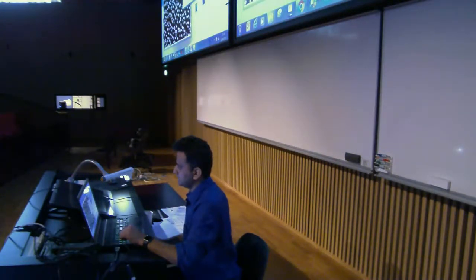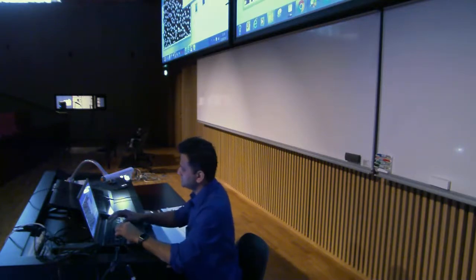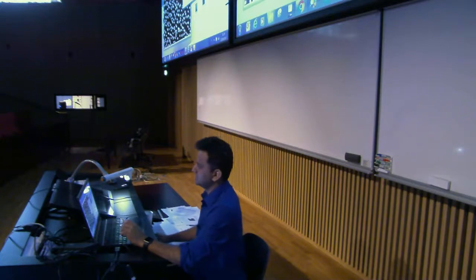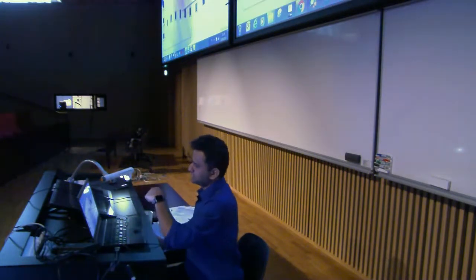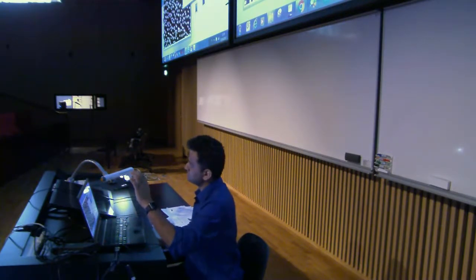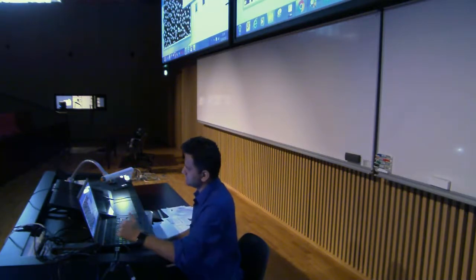And circularity, maybe I'm interested in knowing the morphology or the shape, I want to filter based on the shape of the nuclei. So 0.5 maybe, or 0.2 should be okay, because not all the time will they be circular, right? But I do not want anything which is completely awkward. So I say show, outline. Display results, I want to display the result. Clear results, meaning that if you're doing this process multiple times, a window will be open for the previous measurement, and that will be cleared every time you hit this button.